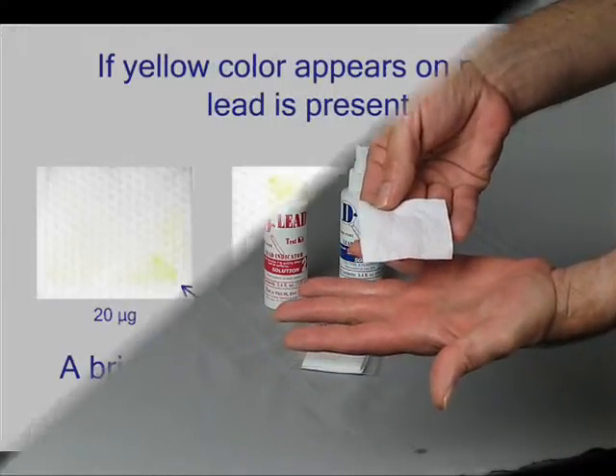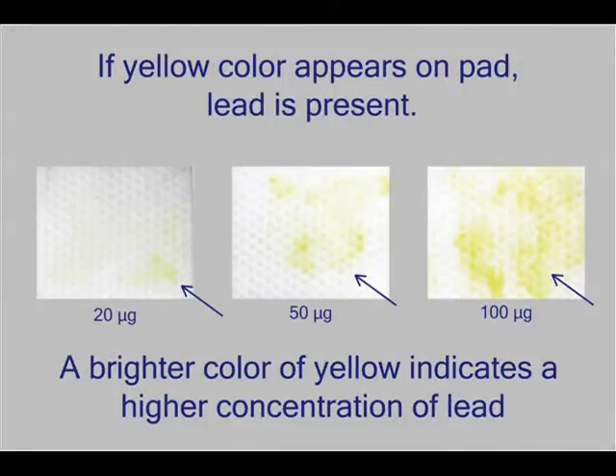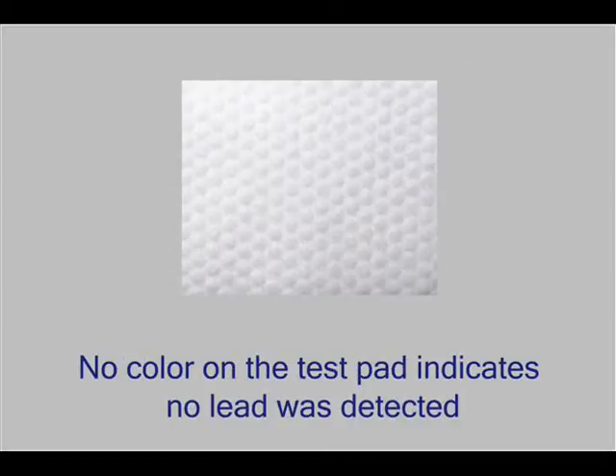If lead is present, a yellow color will appear on the test pad. The brighter the color of yellow, the higher the concentration of lead present. No yellow color on the test pad indicates no lead was detected.